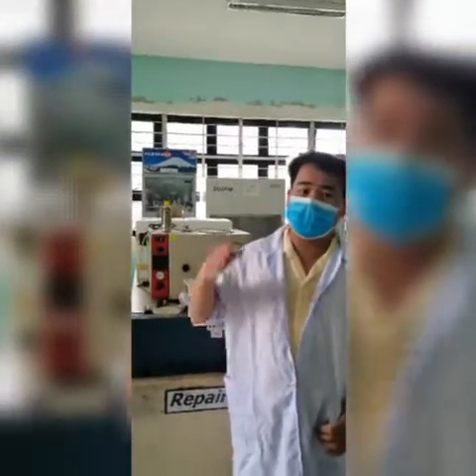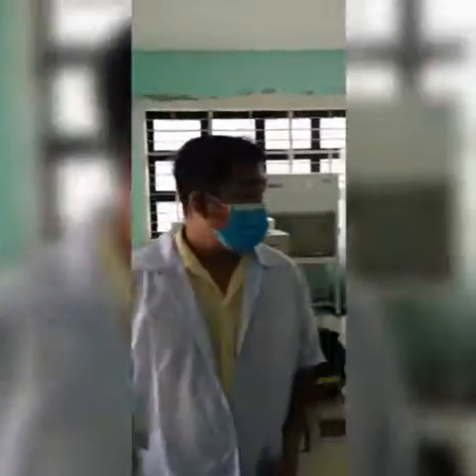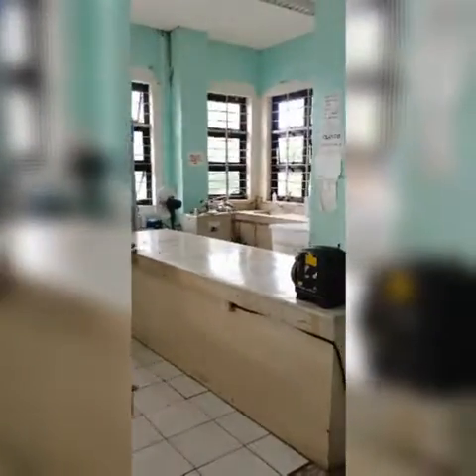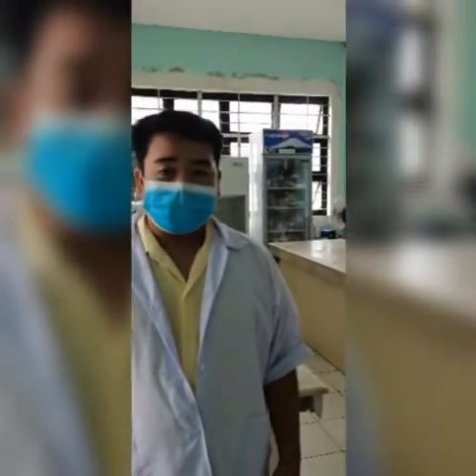This area is basically equipped with different safety devices. So we have the smoke detector, we also have a fire extinguisher, we also have the disposal area for our chemicals, the organic and inorganic chemicals, and we also have different equipment for microbiology. So we have an incubator, the laminar flow hood, and lastly we have the disposal area for microorganisms. We have this equipment we call the autoclave or the sterilizer.